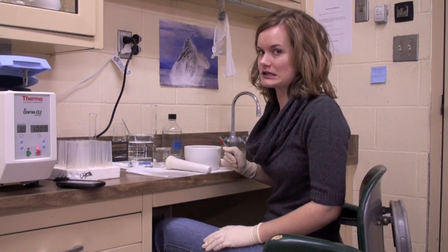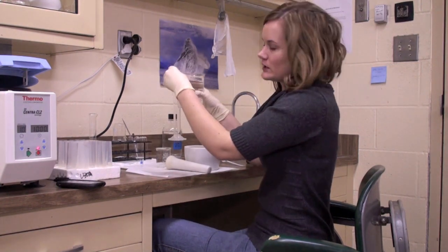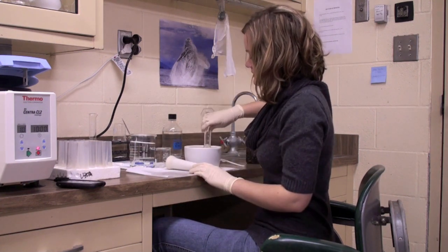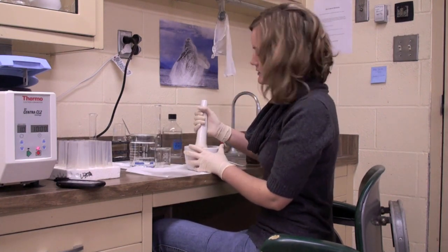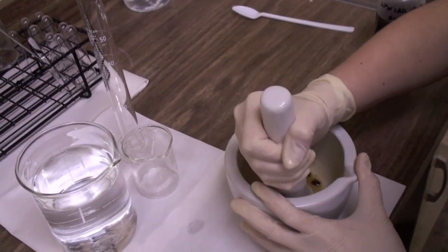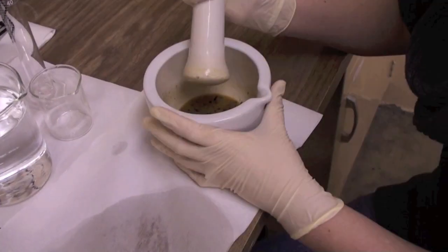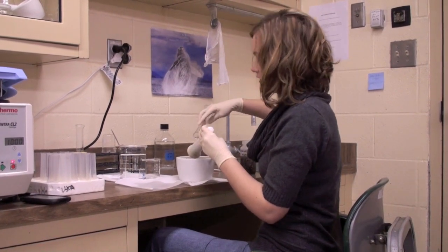Now we have our 50 abdomens off of the bees. At this point we're going to put 10 mls of distilled water into the mix and pour it in with the abdomens. We're going to crush the abdomens into a paste. Now that the bee abdomens are in a paste, we're going to wash off the wand with 15 mls of distilled water, washing it off into the mix.